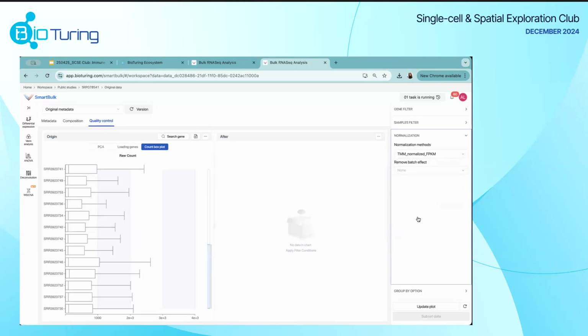So one of the methods that I'll use today is the TMM normalization method, which is a bit different from just applying log10 normalization. It normalizes, or transforms, not only the raw read counts, but it also tries to address compositional biases and differences in library size, as well as allowing differential gene expression analysis to be accurate after this filtering method. So that's the method that we'll mainly be using.